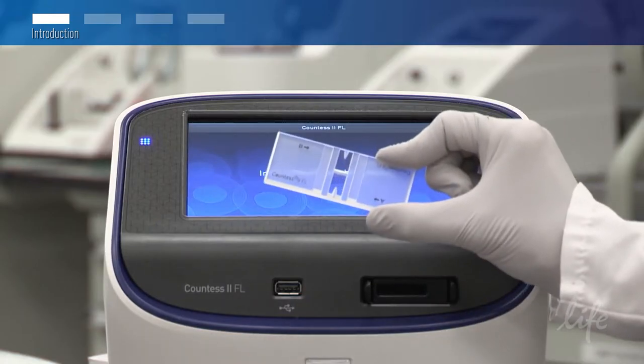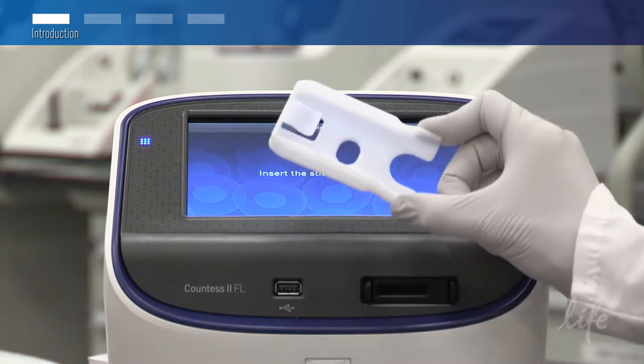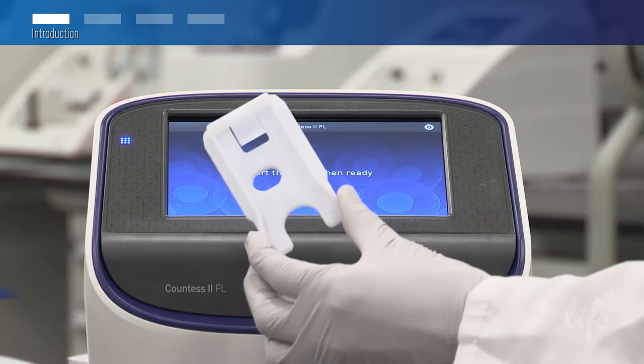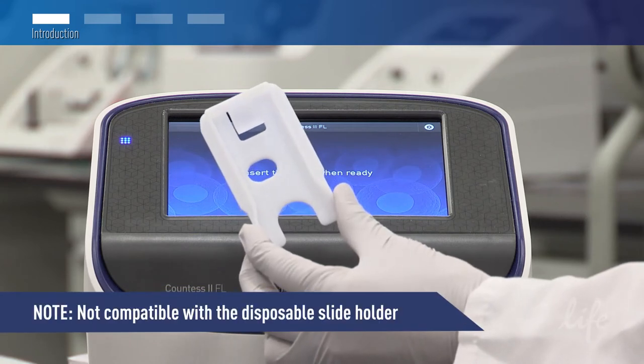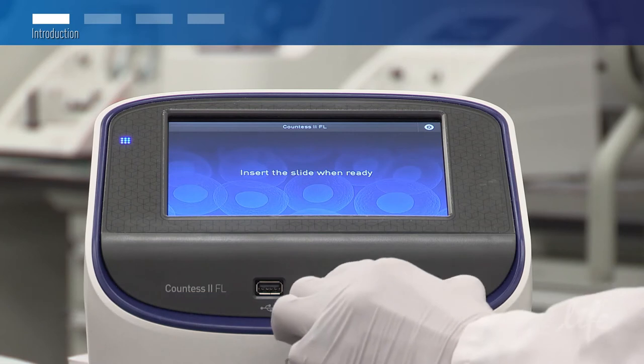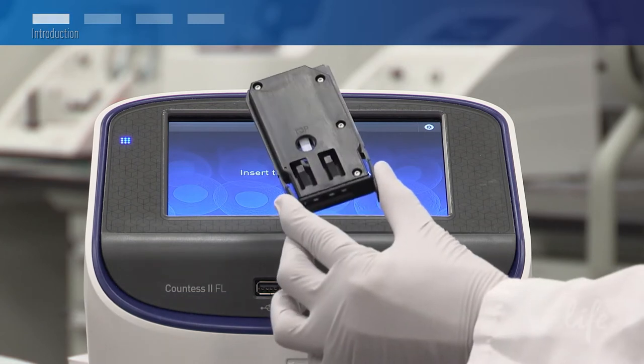You will need the reusable hemocytometer, the hemocytometer slide holder, and the glass cover slip. Please note, the reusable hemocytometer is not compatible with the disposable slide holder that comes with the unit. The disposable slide holder can be easily removed from the Countess 2FL.